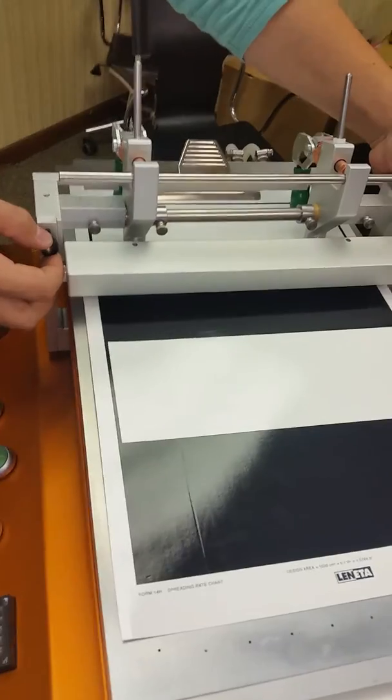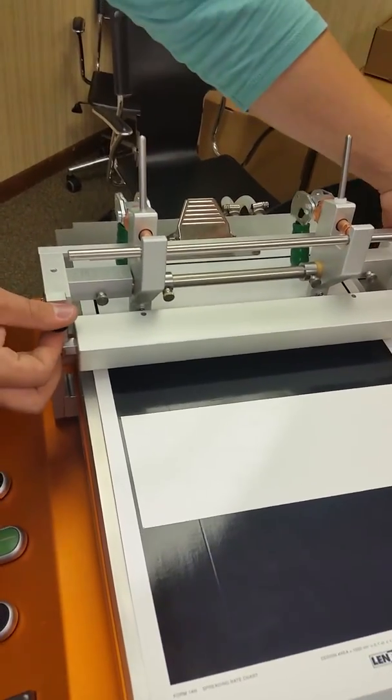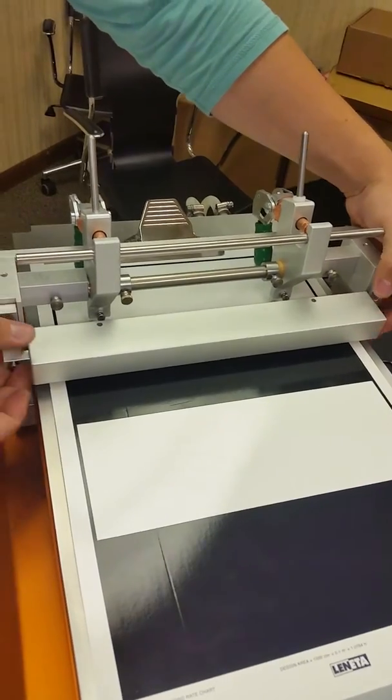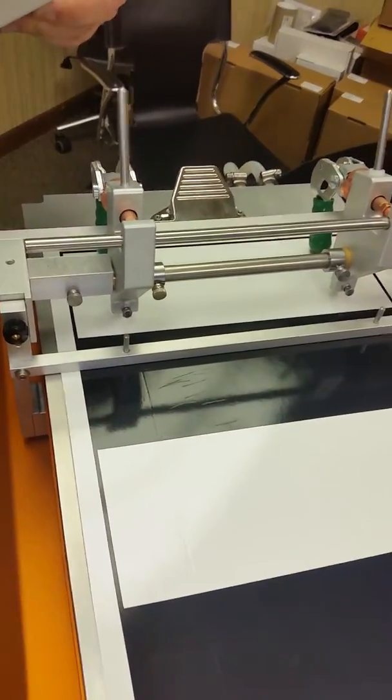As you can see, it goes right onto the pins on the table. Lift it up — show them where you installed it. Right here. Apply the weight down.